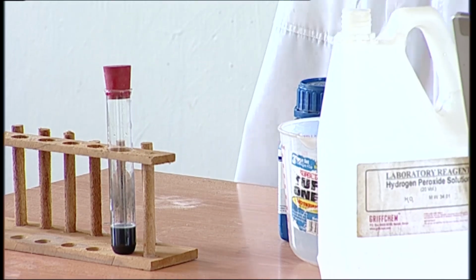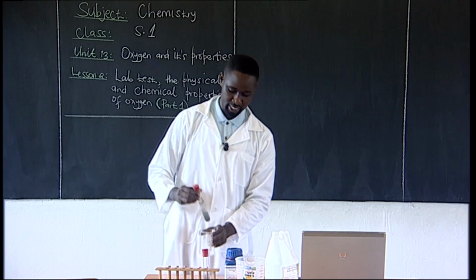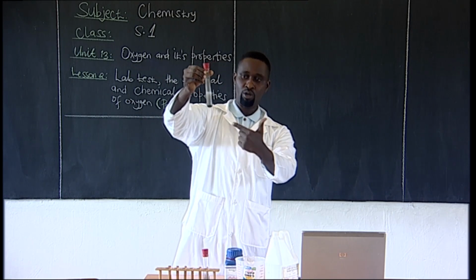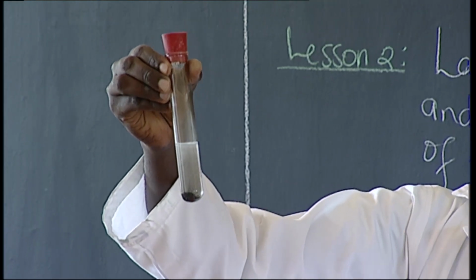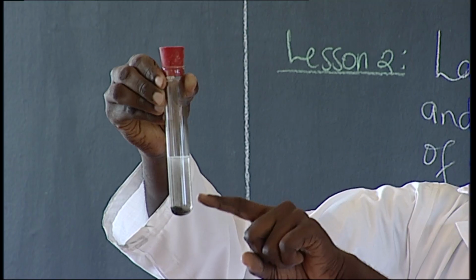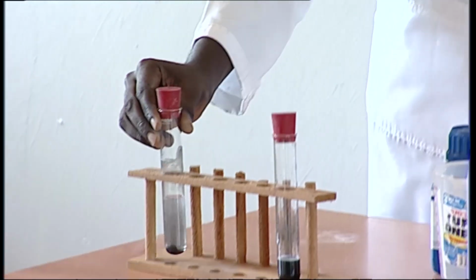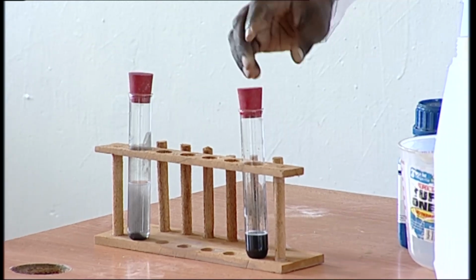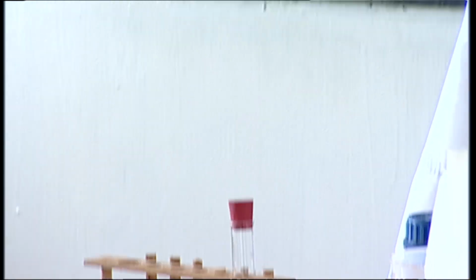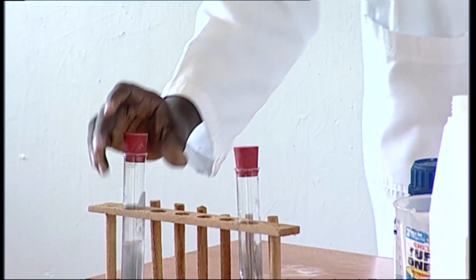But to make our experiment faster, I had mixed the same components earlier. Because the reaction is a bit slower, it requires some time. I had mixed the same components earlier, so we are going to use this gas that has been produced to carry out our tests. This was basically to show you the components I've mixed to form this. In here, I have the gas.